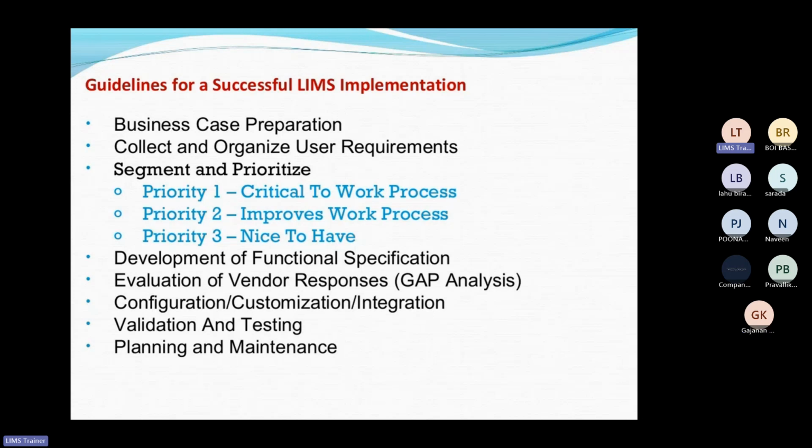And they want some person. Suppose one person is from a pharma background. He has worked in the laboratory for at least, for example, 5 years. So he has ample knowledge about the laboratory or end user level. When they are developing that particular software, the person who has 5 years of pharma experience understands the end user requirements. He understands what the end user will require, so according to that the software development will happen. The IT industry will develop the software as per the user requirements.